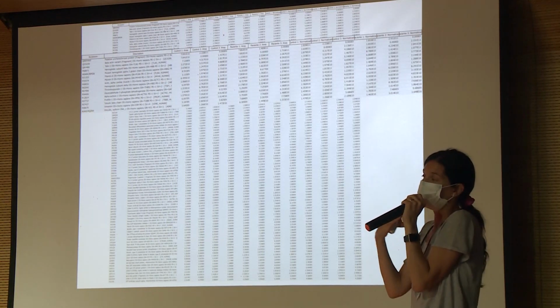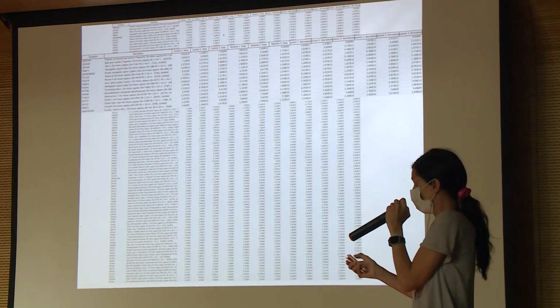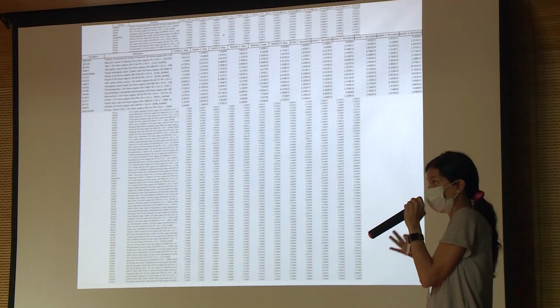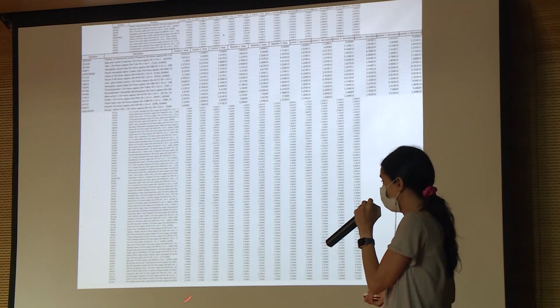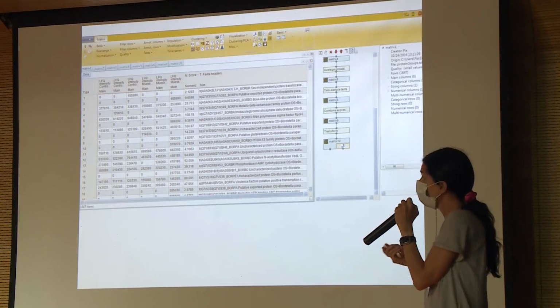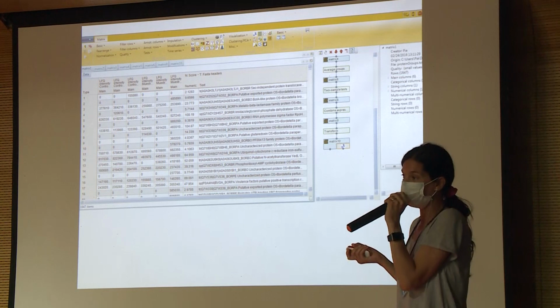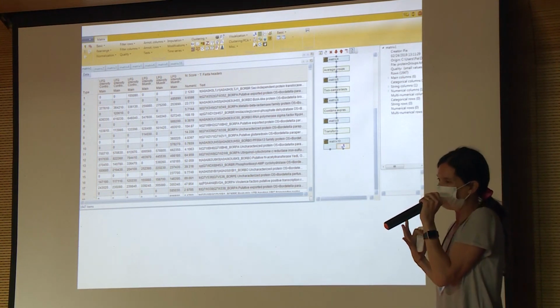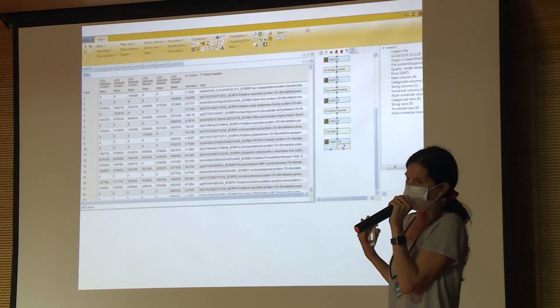You have to add up all the areas for each condition, and they should be pretty similar, because if the total amount of protein you put in each condition is the same, the addition of the areas, even though there may be internal variations in certain proteins, the addition should be similar. Then you normalize the additions to one of the conditions, and then you go to this software that Germán was mentioning just now, which is Perseus, which is like a modified Excel to work with proteomic data.